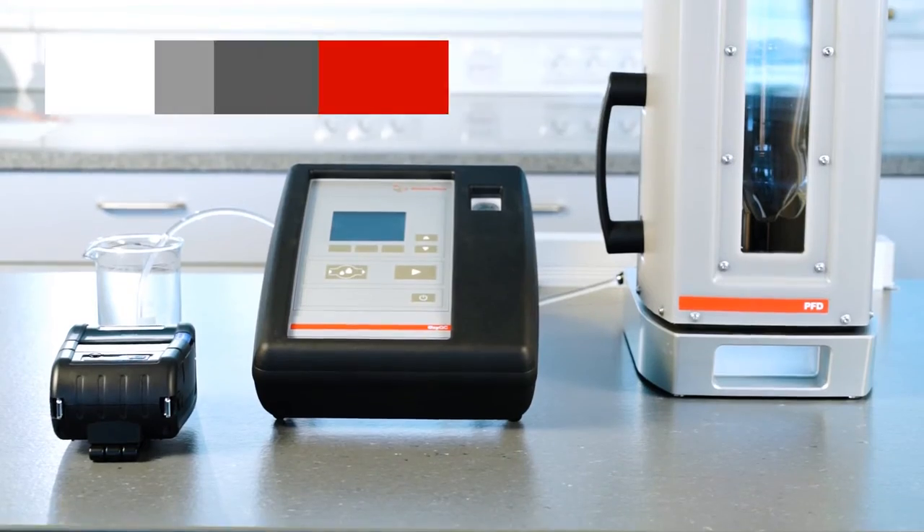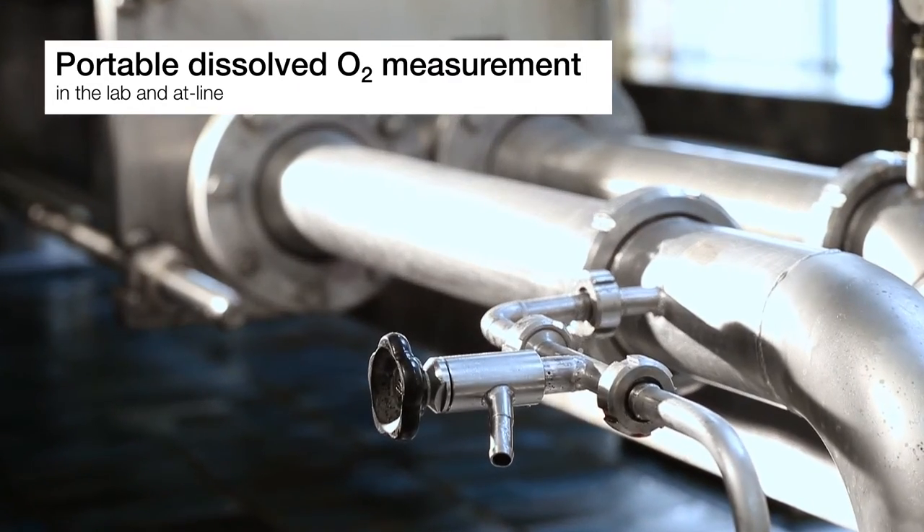OxyQC Wide Range is portable. It can be used in the lab as well as directly at the production line. It's fully robust for harsh environments. This kind of flexibility saves you time and money.